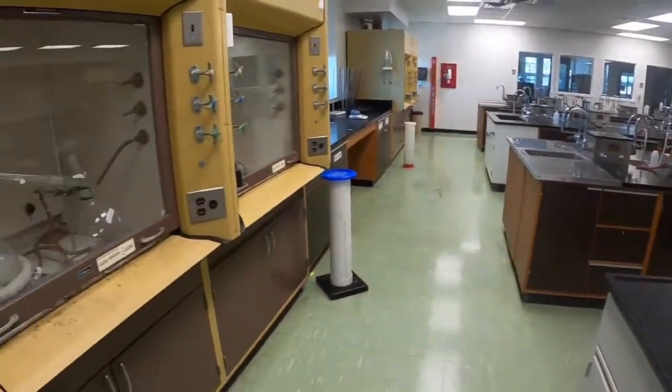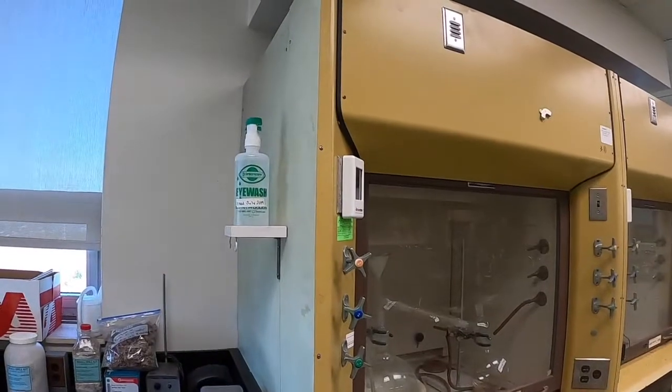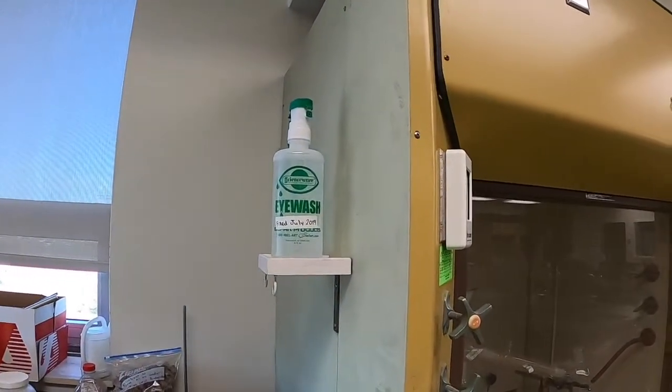The portable eyewash stations are kept on each side of the fume hoods. We have four fume hood stations, and that means there are a total of eight portable eyewash stations.